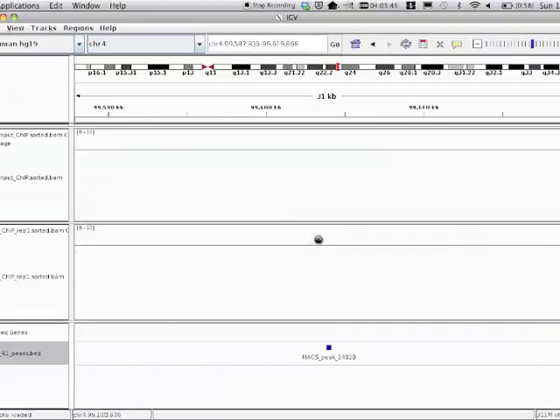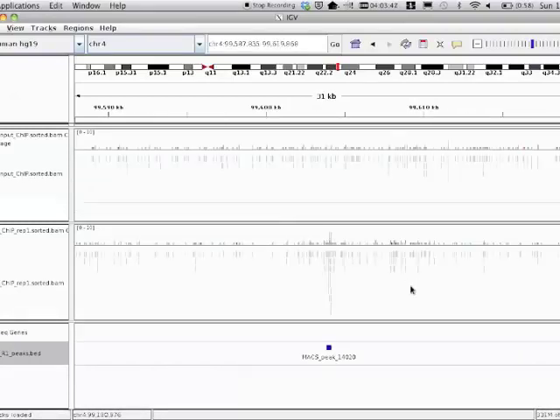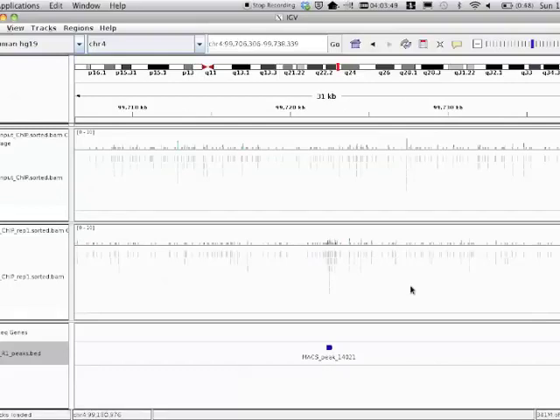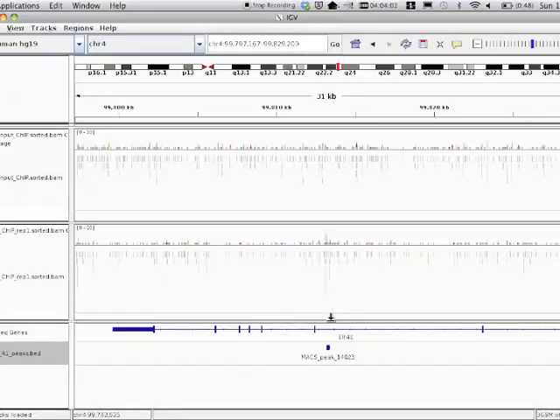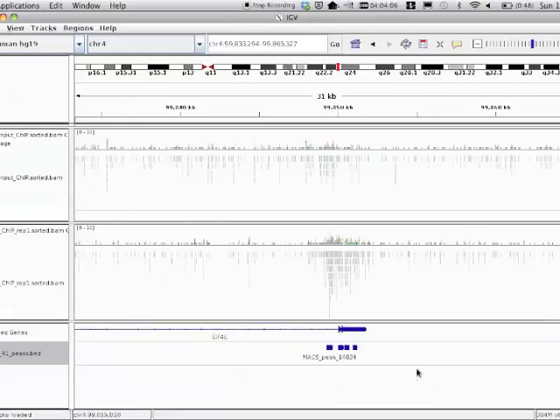I do see a little bit of a peak there, and if I keep clicking through, I do see some slight enrichment, and it's not as strong as the sharp ChIP is, or the CTCF that we were just looking at. That's probably because they don't have enough actual reads to do something as broad as Pol II, and that comes in planning your experiments properly.